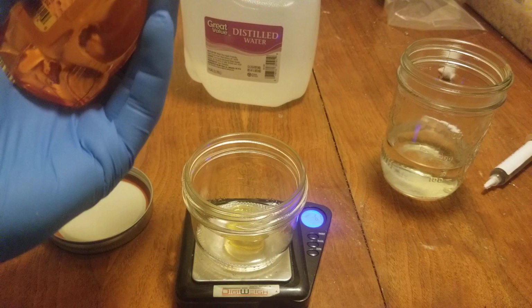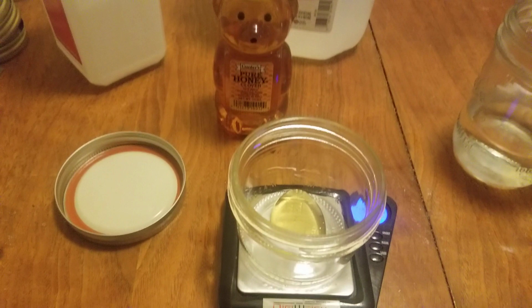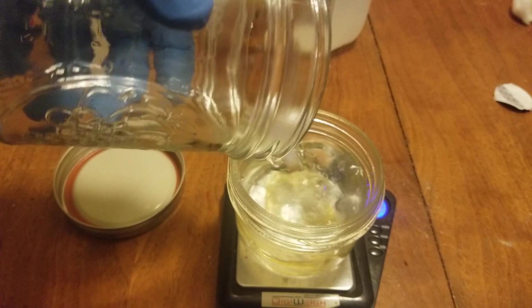All right, so perfect. We got 6.1 grams. Let me see if I can show you guys that really good. Oh my God, the lighting is so bad on that. You're going to have to take my word for it. It's 6.1 grams of the honey right there. We're going to take our distilled water, 150 milliliters, and pour it right on top. Perfect. And now we're going to put our lid on.